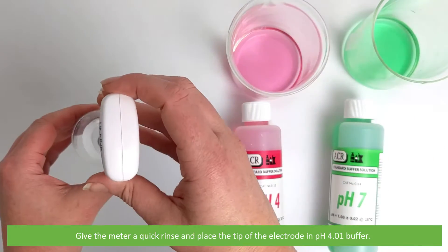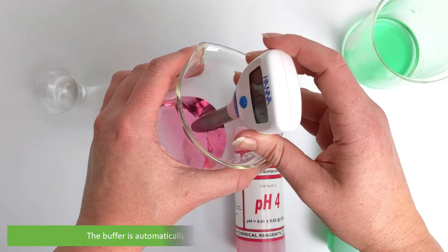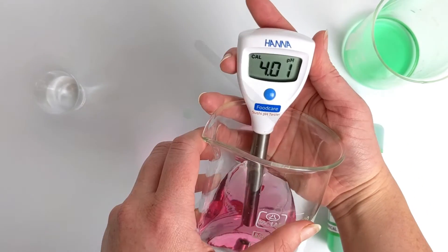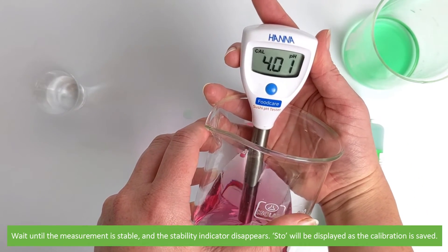Give the meter a quick rinse and place the tip of the electrode into the PH4.01 buffer. The buffer is automatically recognised and the stability indicator will blink. Wait until the measurement is stable and the stability indicator disappears.